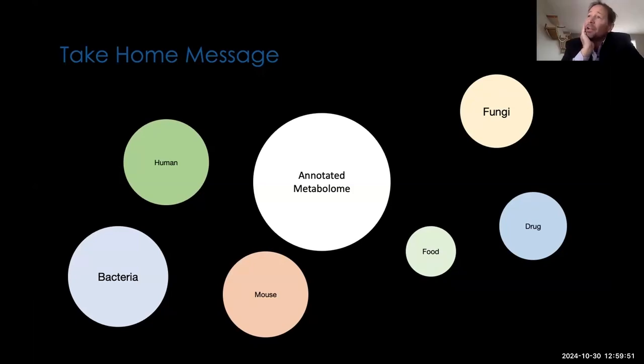Yeah, so that's a great question. So we're primarily biased with the foods that we have that were really accessible to us. So primarily what students and faculty around us were eating. That's likely also not representative of the entire world population. So there's two strategies that we really like to use to expand the food reference library.